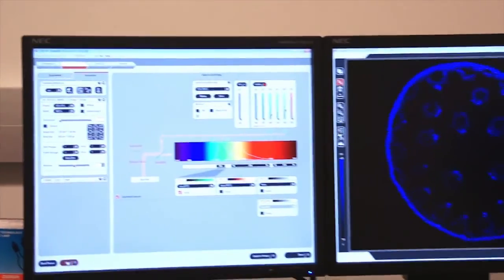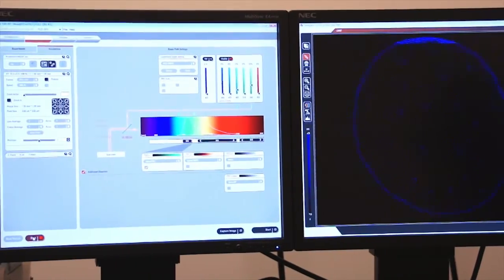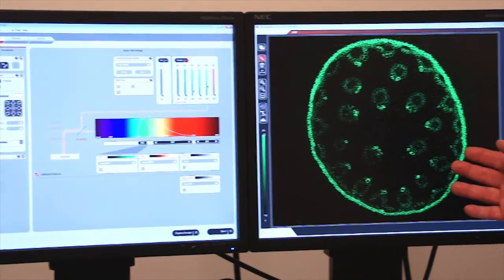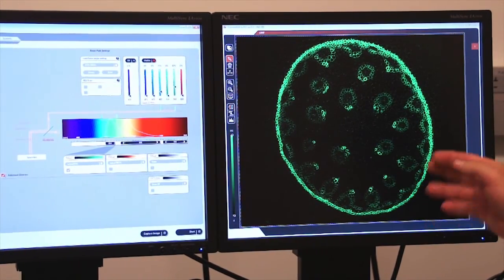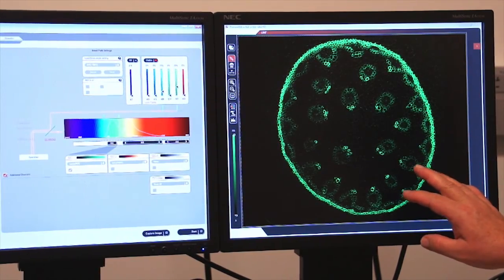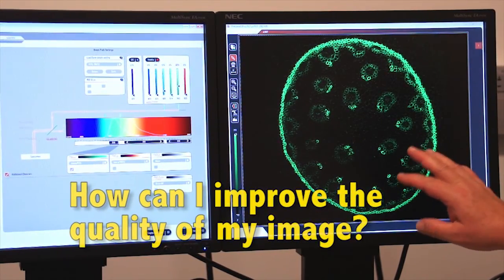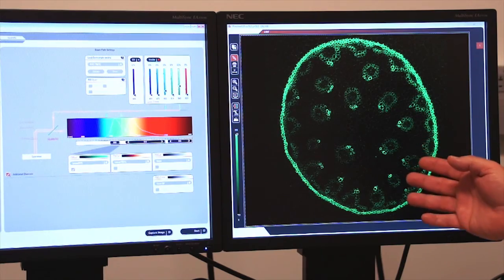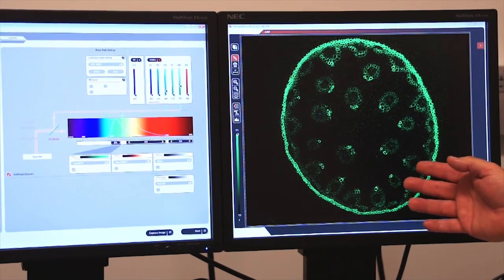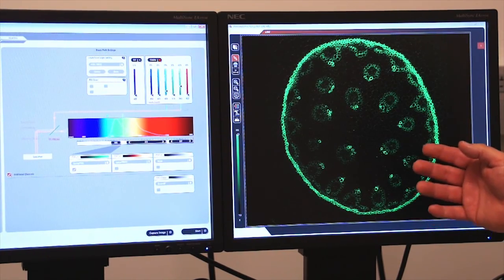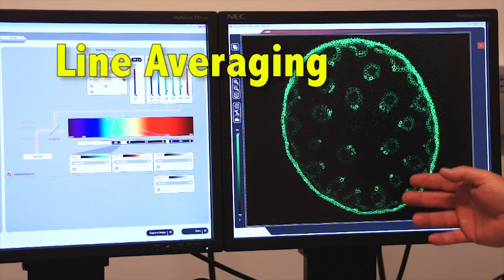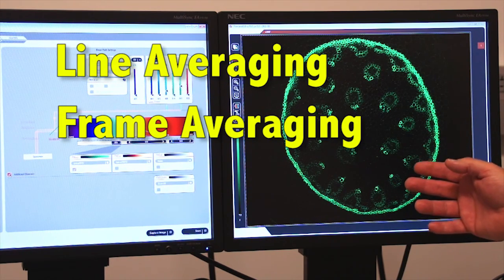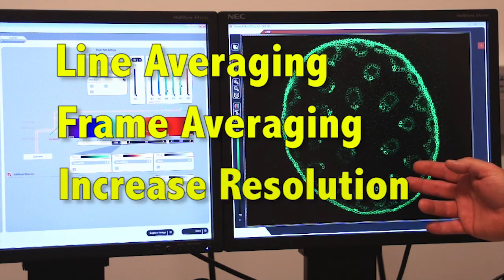Let's collect a live image on our screen. And as you can see, I have a fairly well illuminated image, but it's a little bit grainy. How can I improve the quality of my image? There are several ways to improve the quality of my image. One is to use line averaging. The other is to use frame averaging. And finally, I can increase my resolution as well.